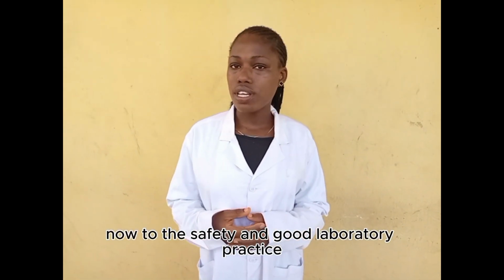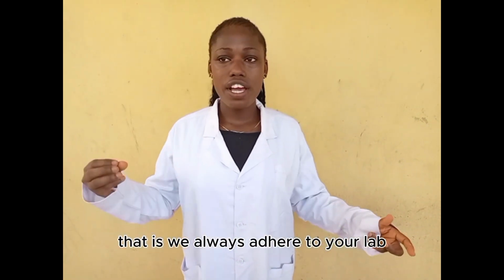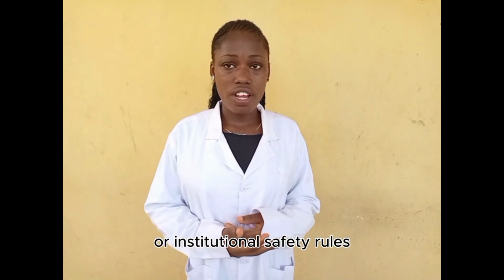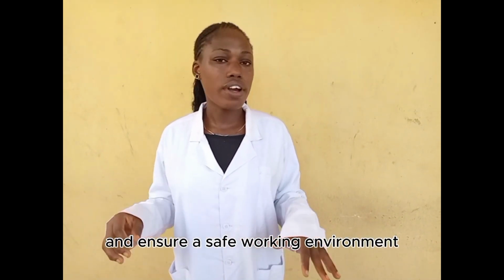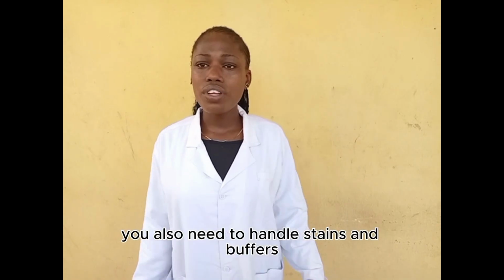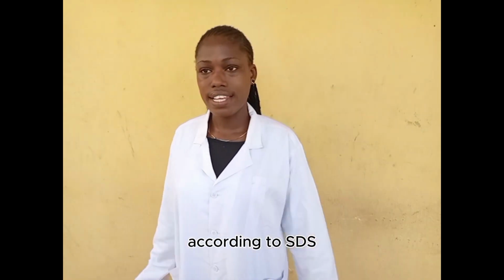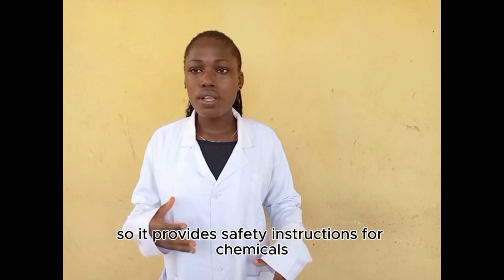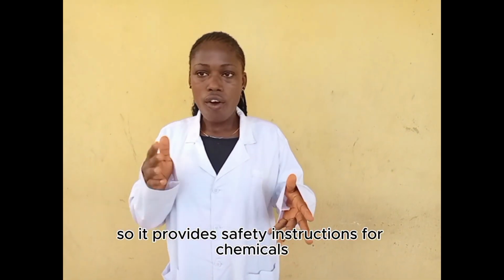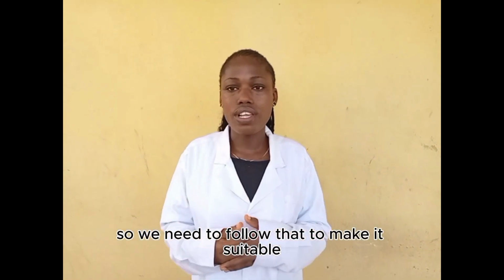Now, for safety and good laboratory practice, we have to follow the institutional safety guidelines. That is, we always adhere to our lab or institutional safety rules to prevent accidents and ensure a safe working environment. We also need to handle stains and buffers according to the SDS, that is, the Safety Data Sheet. It provides safety instructions for chemicals, so we need to follow that.